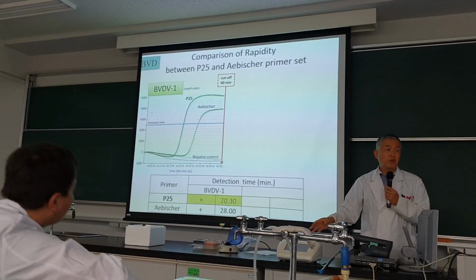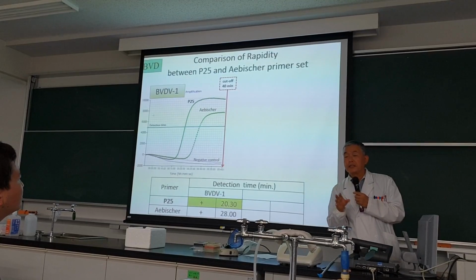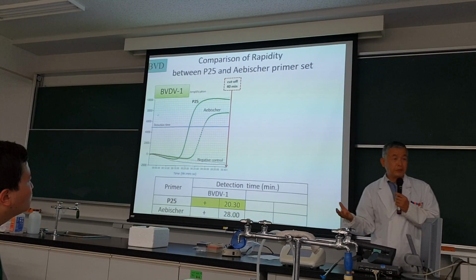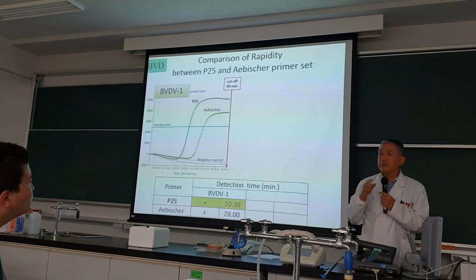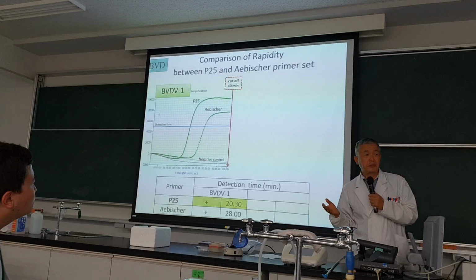It's a good system for screening tests. If you detect influenza from wild birds, it is sometimes low frequency, and you cannot always bring the sample to the specified influenza diagnostic center. So you need to do some screening tests.